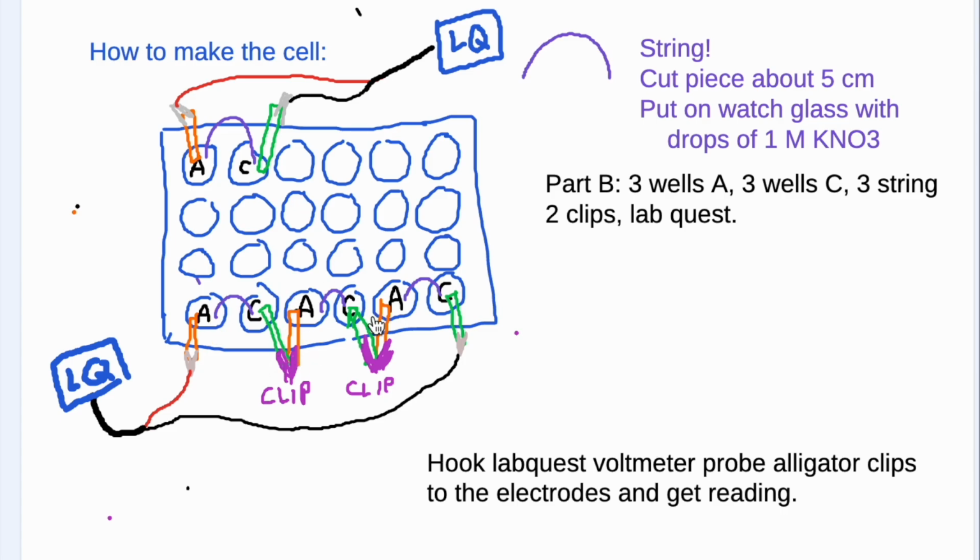So these values should be additive. So you're going to show what you calculate, what you predict the value should be, and then report what value you actually see for this part B of the lab experiment.